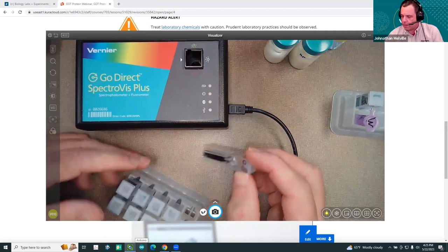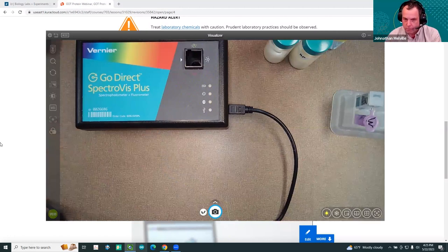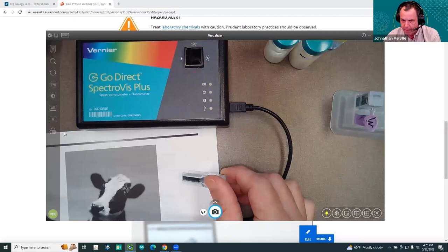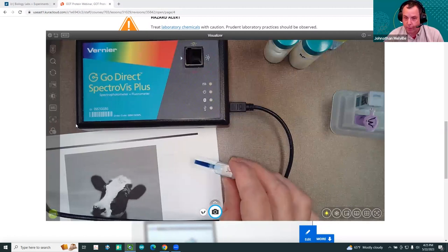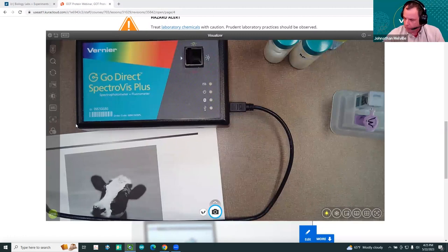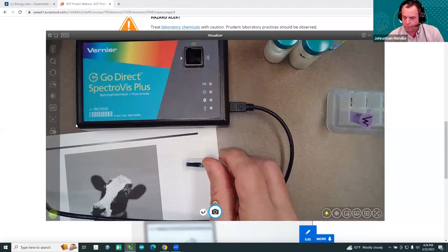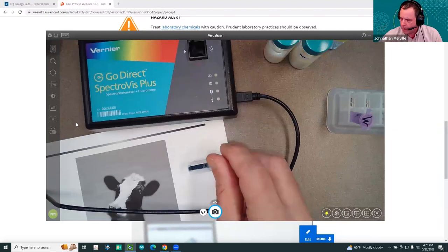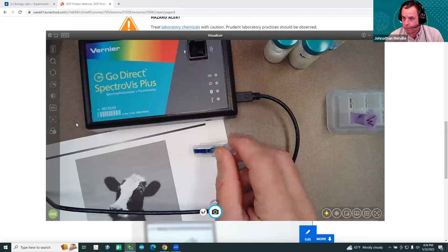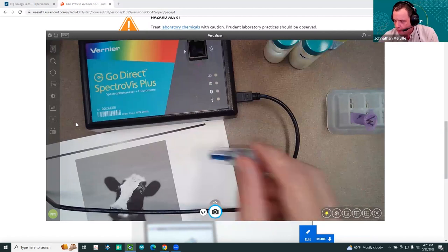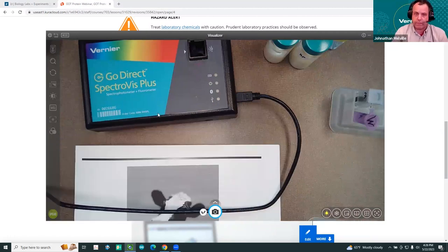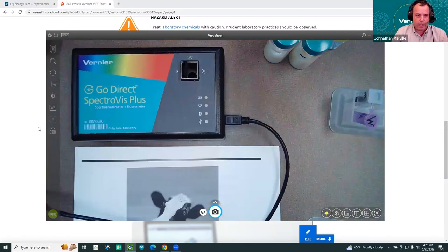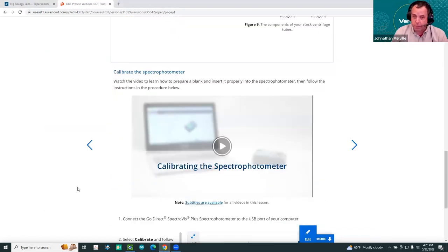Let me show you the prepared samples visually. Here's some PBS — this is just normal Bradford reagent; here's some Bradford that hasn't reacted much, so no high protein concentration. Here's the 2.0 standard — you can see it's bright blue. Here's just milk — slightly blue. And here's high protein — it's a lot bluer. You can also do this lab qualitatively, but the spectrometer lets us do it all quantitatively.